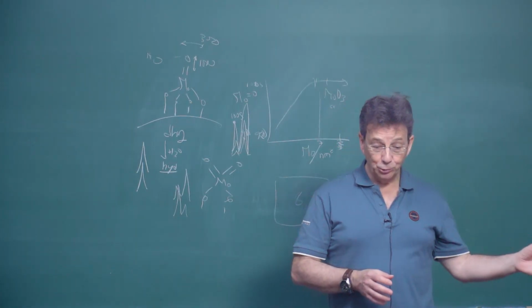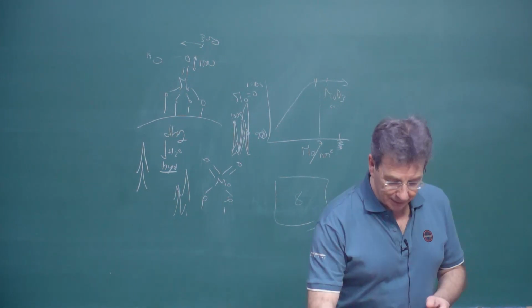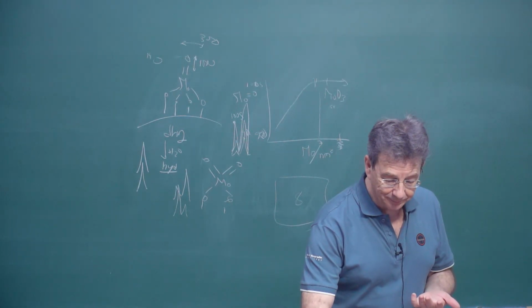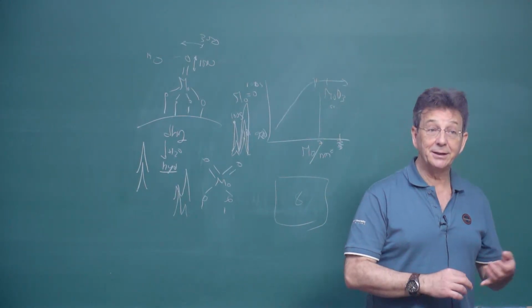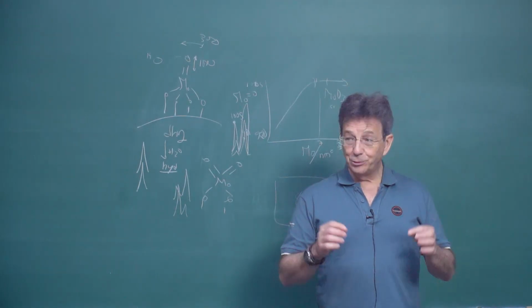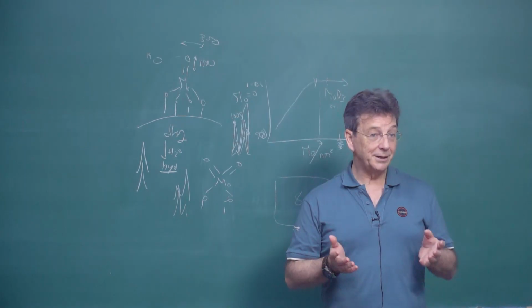And what Gautam and Israel were doing is looking at all these supported vanadium samples on different supports with different concentrations. Why different concentrations? Because by changing the concentration, you change how many solute molecules you have per milliliter. And by changing the support, you have a setting on the pH, because supports like magnesia are more basic, supports like silica are more acidic. And then what they found is that the vanadium compounds that you were obtaining on supported vanadium oxides were essentially determined by the pH and by the concentration, the liquid phase chemistry.